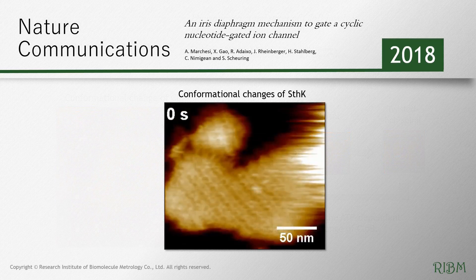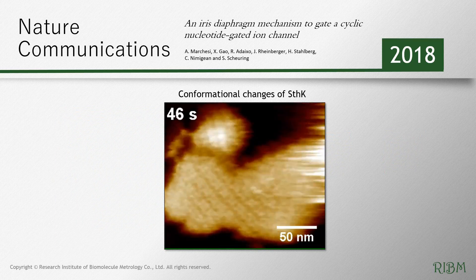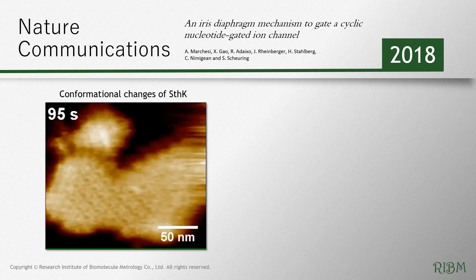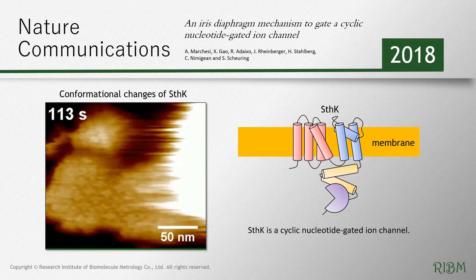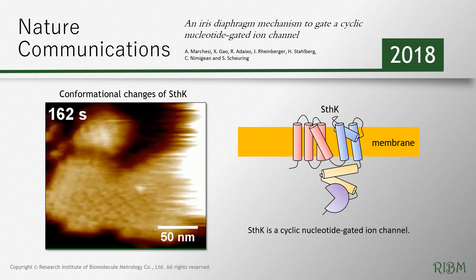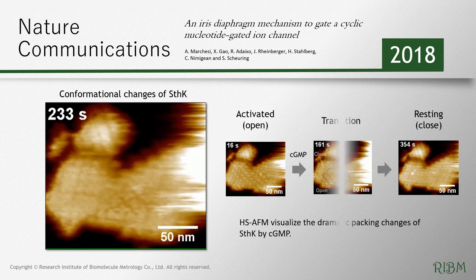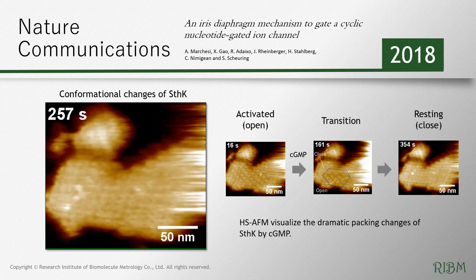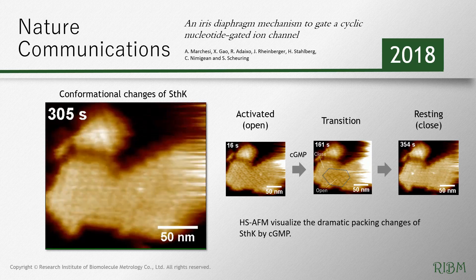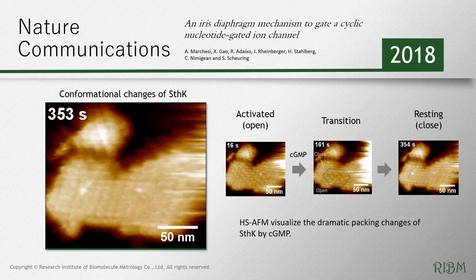The video shows the conformational changes of STHK. STHK is a cyclic nucleotide gated ion channel. High-speed AFM visualizes the dramatic packing changes of STHK by cGMP.